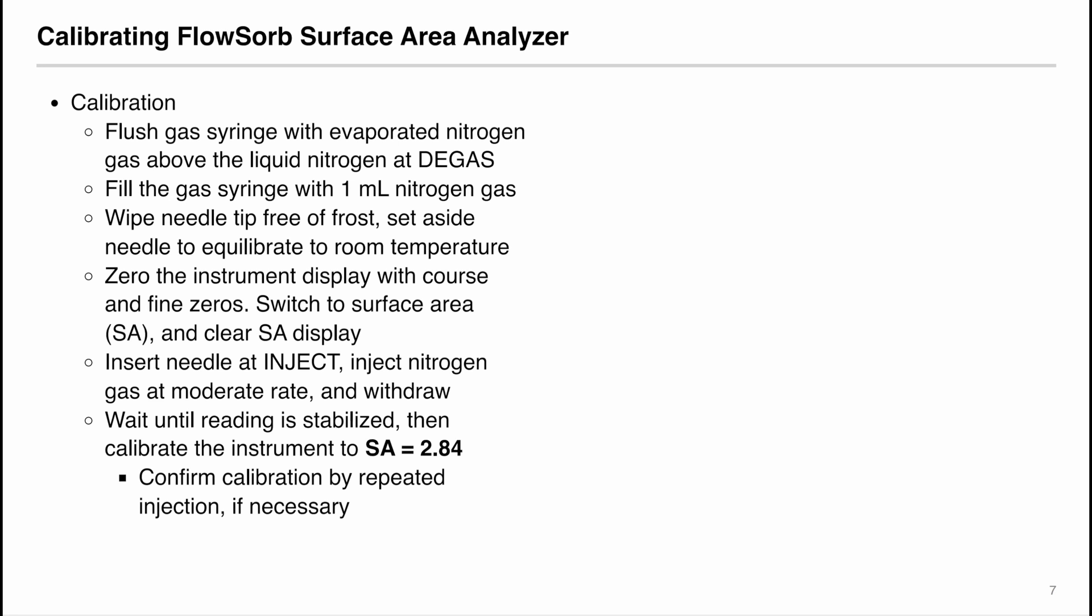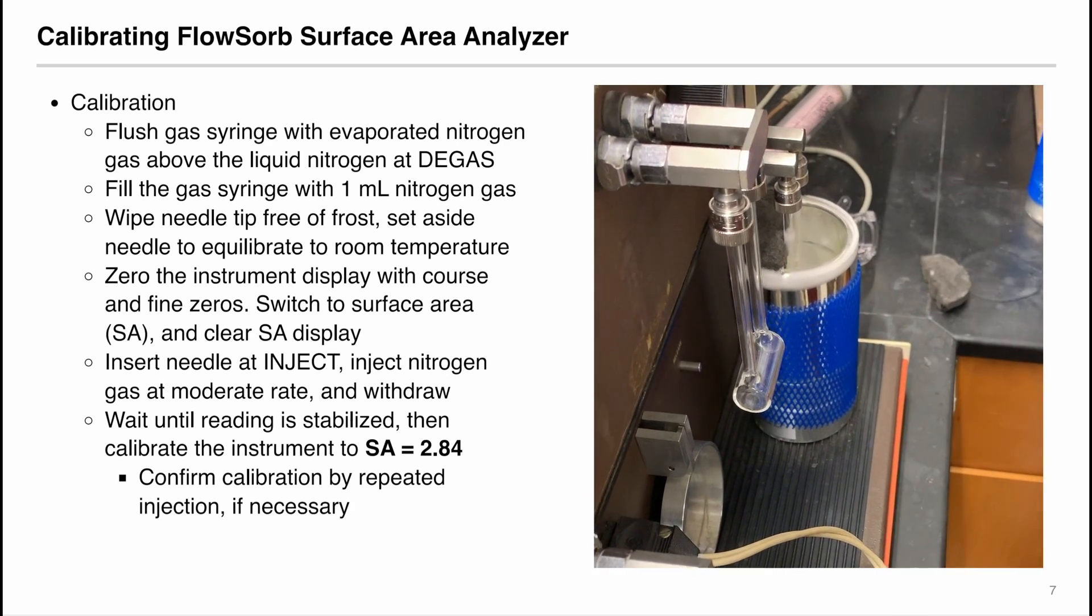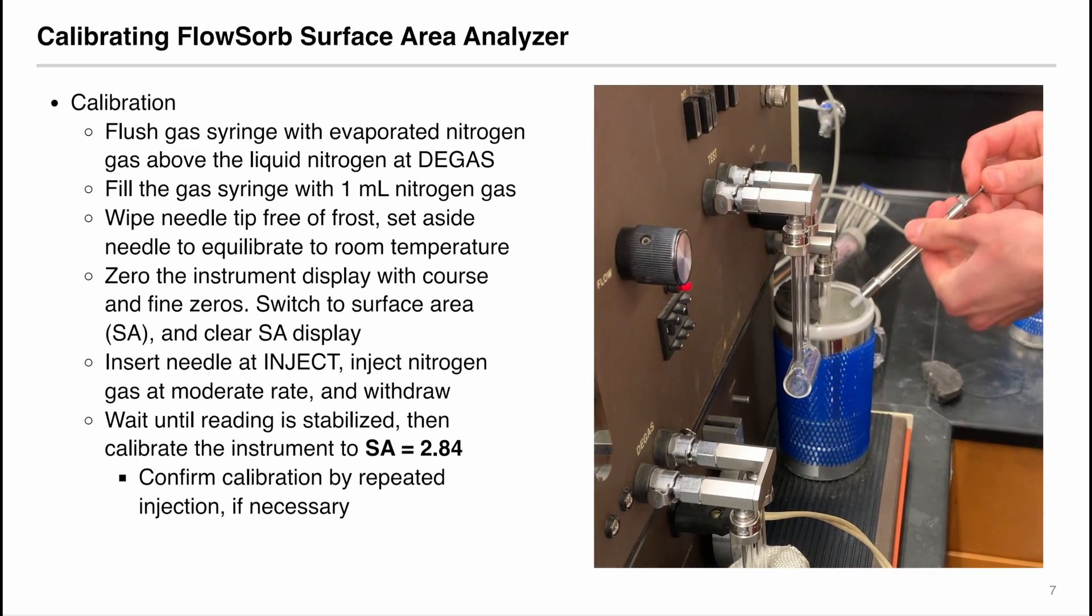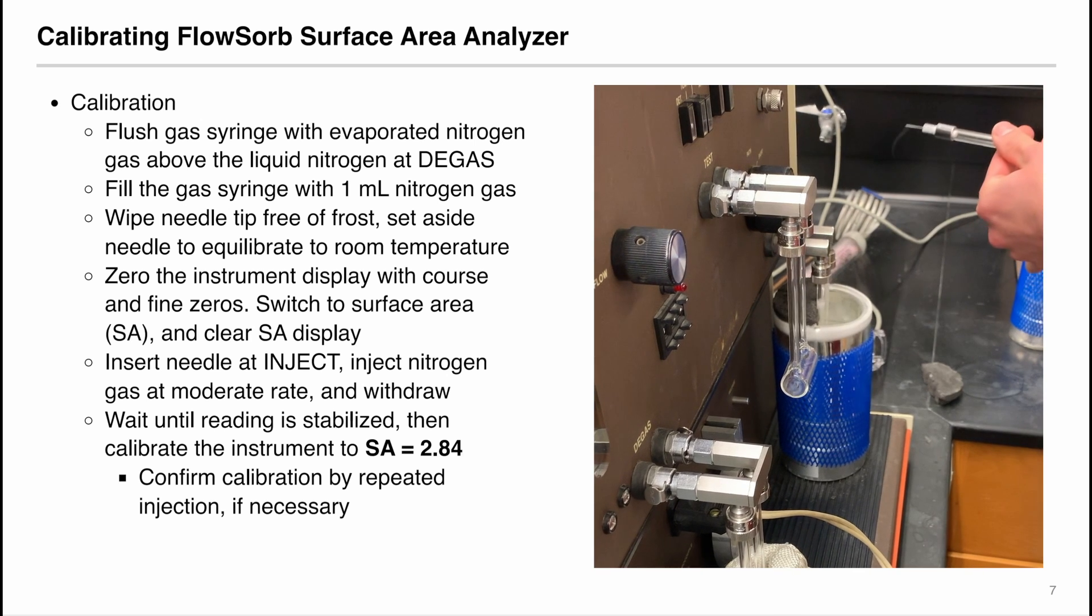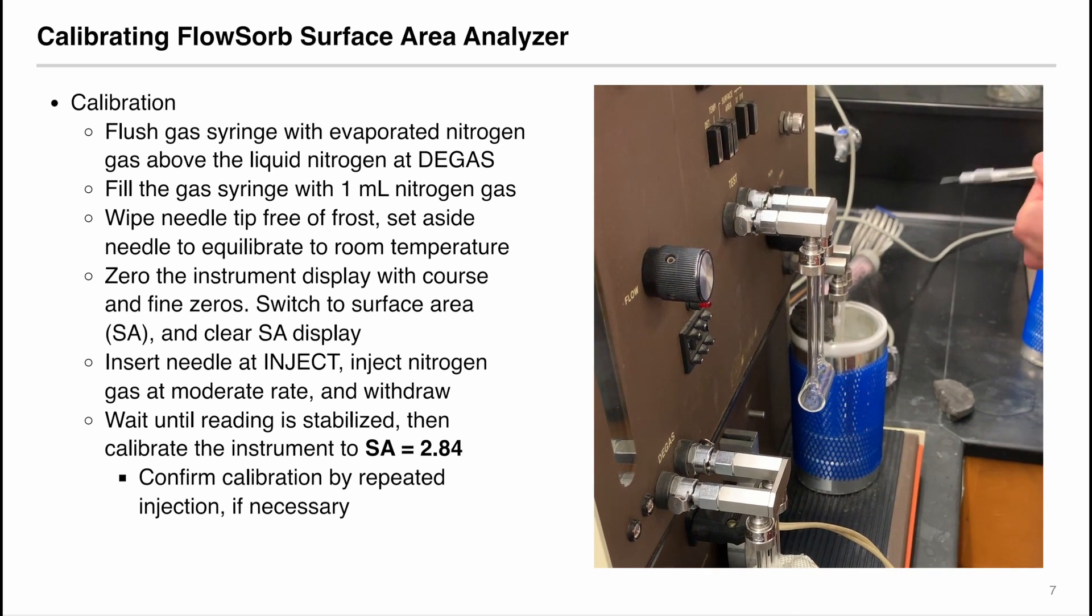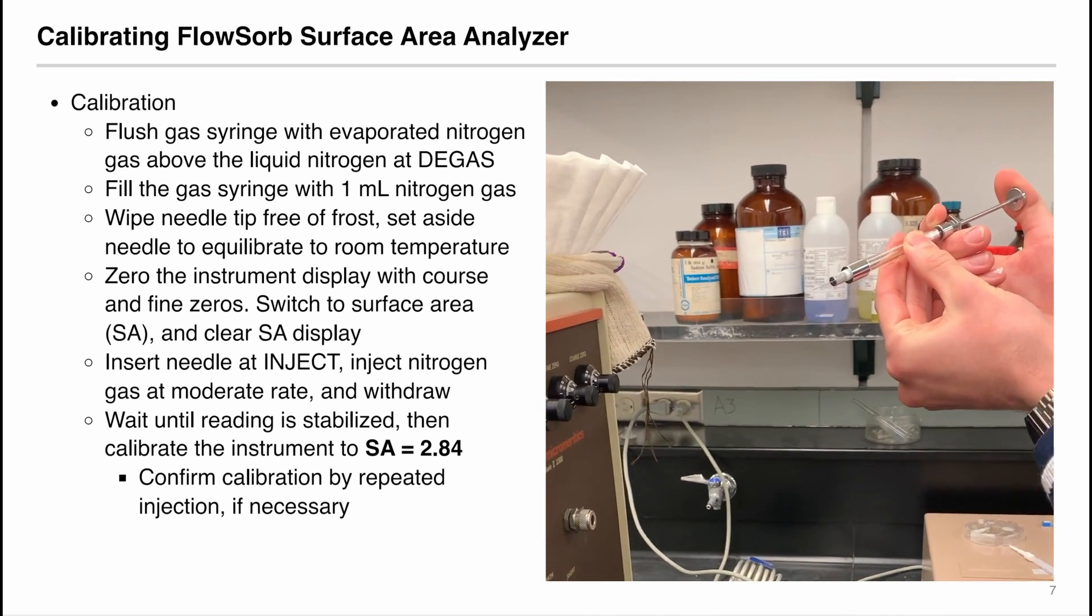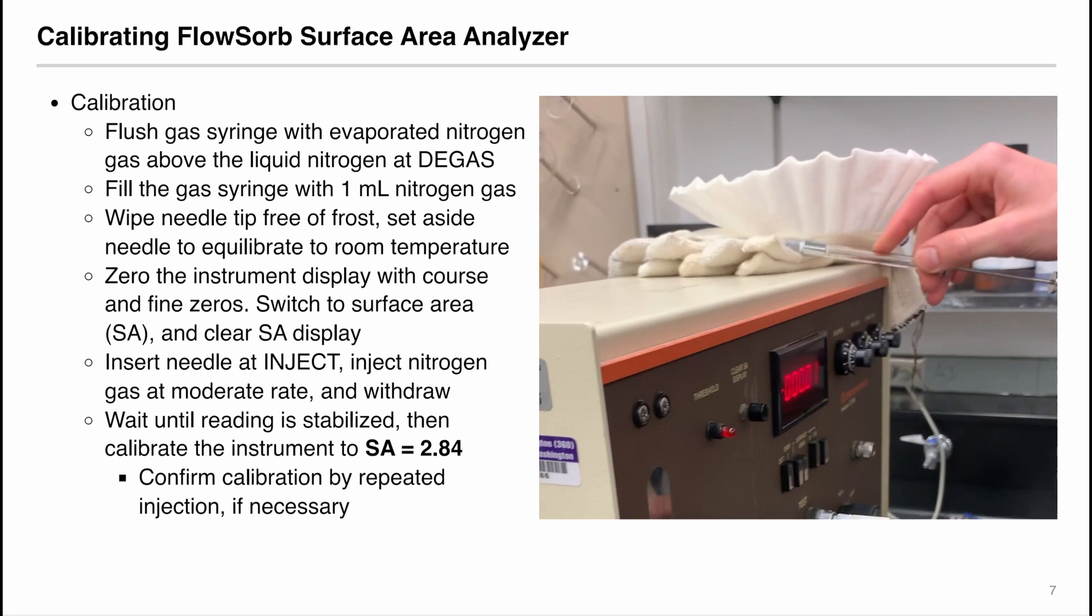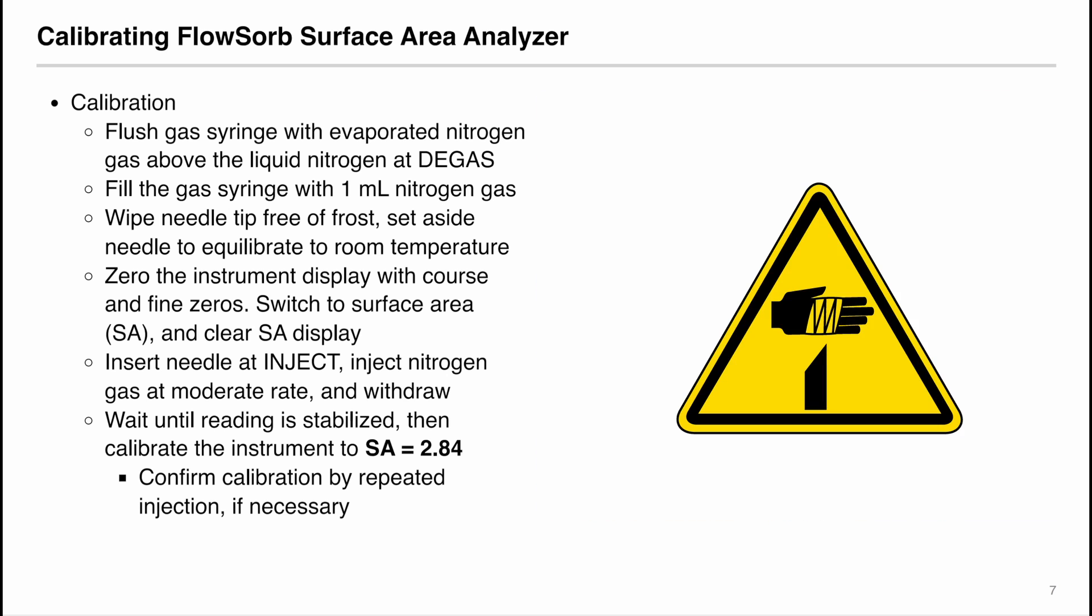To use the instrument, we must first calibrate the instrument. First flush the gas syringe with the evaporated nitrogen gas above the liquid nitrogen at the degas position. Make the gas syringe above the surface of the liquid nitrogen. Just like when you would rinse a syringe with deionized water, you would just rinse the gas syringe with the gas nitrogen. After rinsing, fill the gas syringe with one milliliter of nitrogen gas. Because it is cold, wipe the needle tip free of frost and set the needle aside. The needle will need to equilibrate with the room temperature. Make sure you never point the needle to anyone and handle the needle safely.